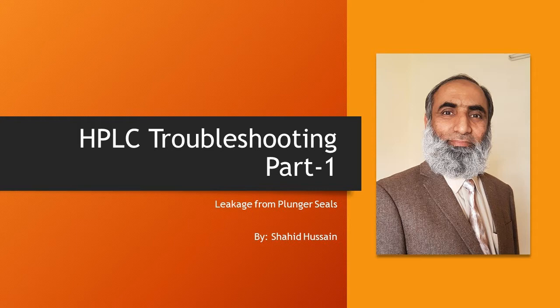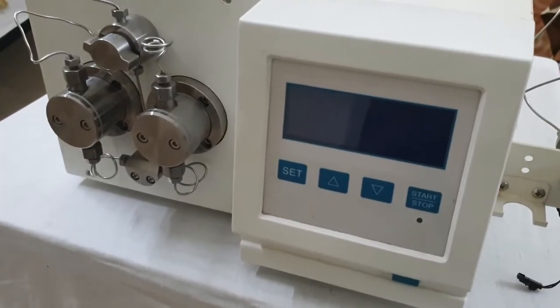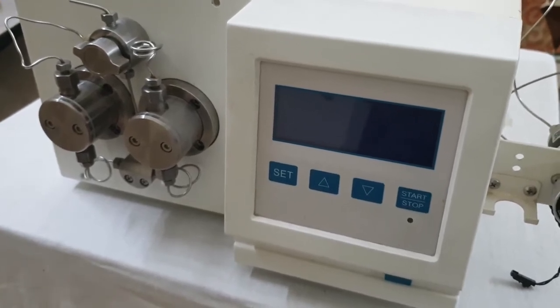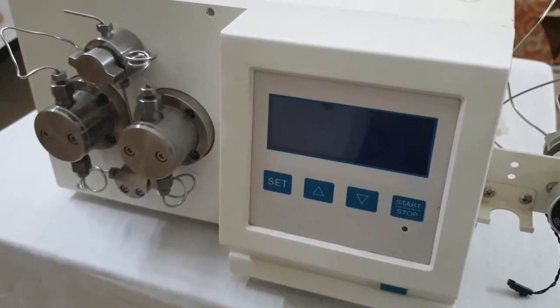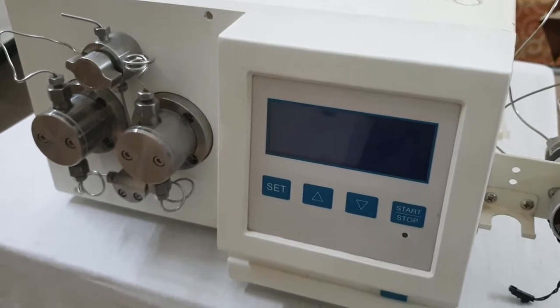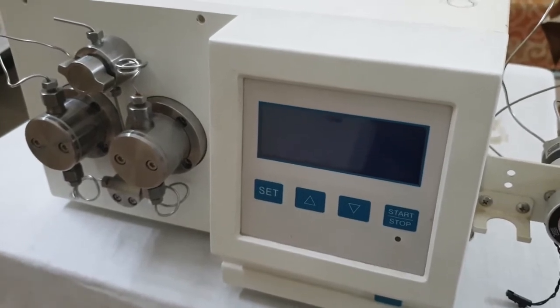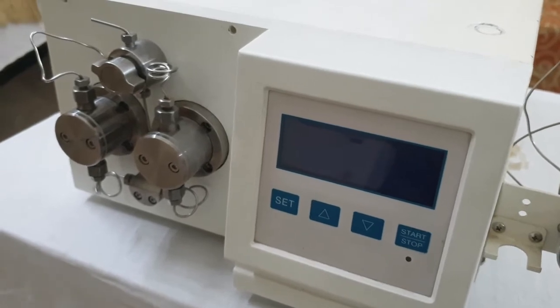Assalamu alaikum. This is an HPLC pump and today we will learn how a problem is resolved in this HPLC pump. The problem we have is leakage from the body and the drain of the body — liquid is coming out from the drain while pumping.